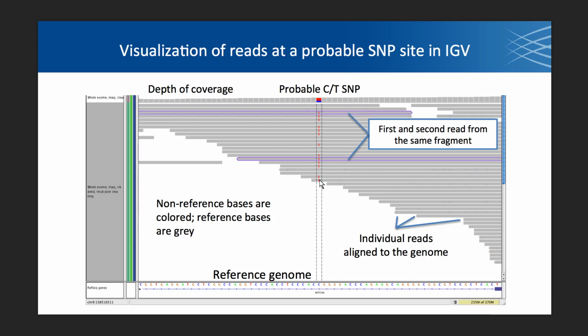And so there are a lot of different attributes that you can look at for particular variants in IGV to see whether you think that they're high quality or not. Like if you see some variants that are causing some strange results later on in your analysis, you can open up the BAM, you can look at the reads, and you can say, do all these things make sense to me? And you can click through the reads and get all the cigar information and things like that too, which is pretty helpful.